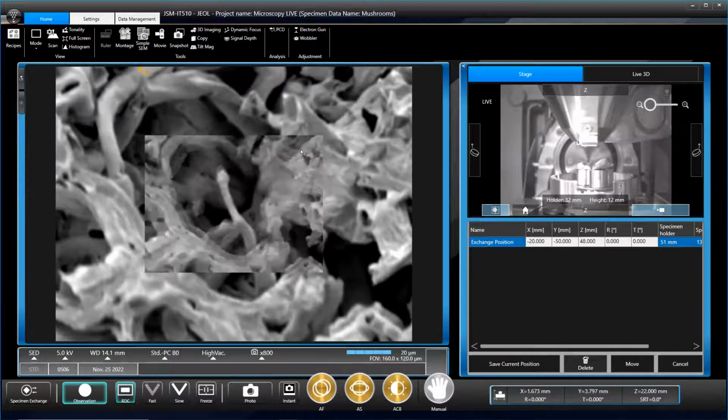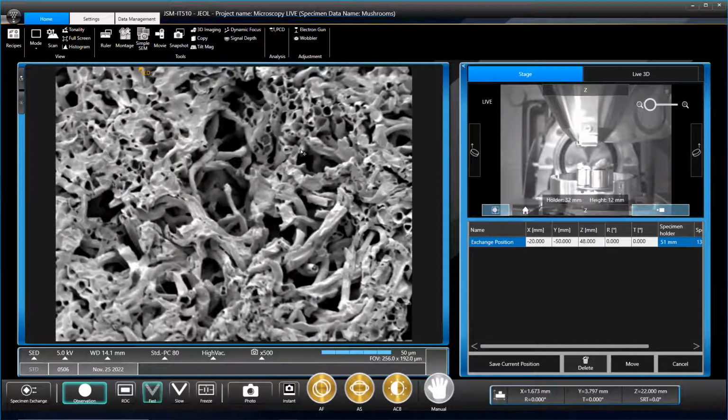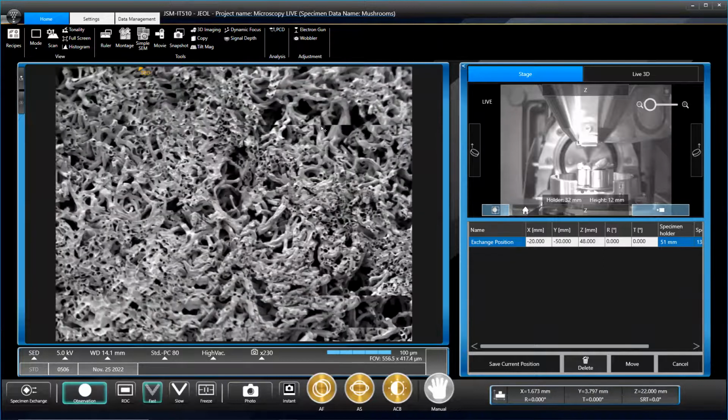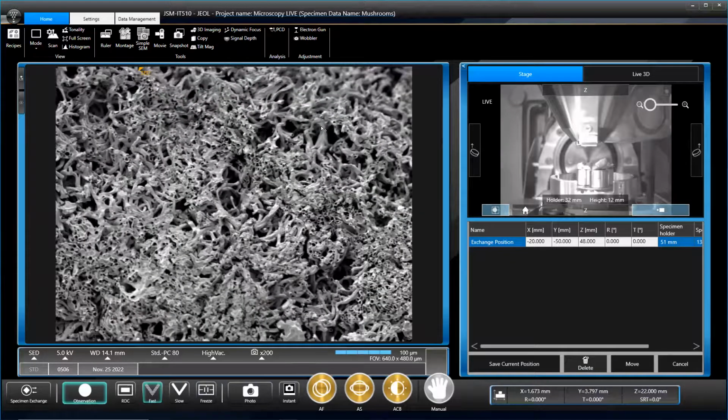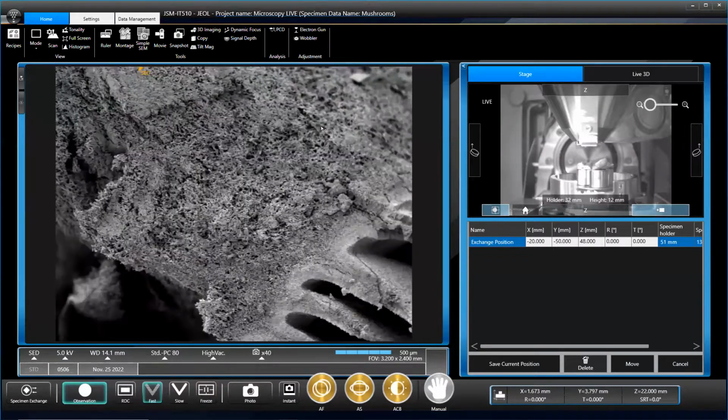It's really cool. These tubes are so weird looking. So these are all hyphae still? Yep, I believe so. Why do they have to be hollow? I believe it's because they're one cell thick, so that'll just be the inside of them.